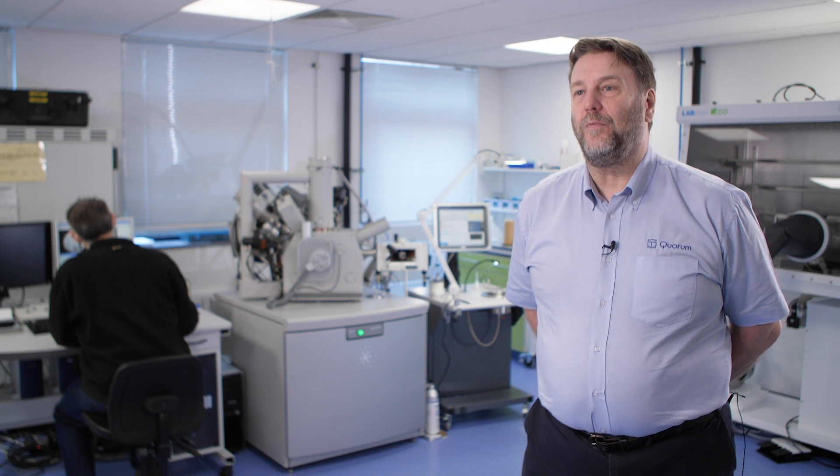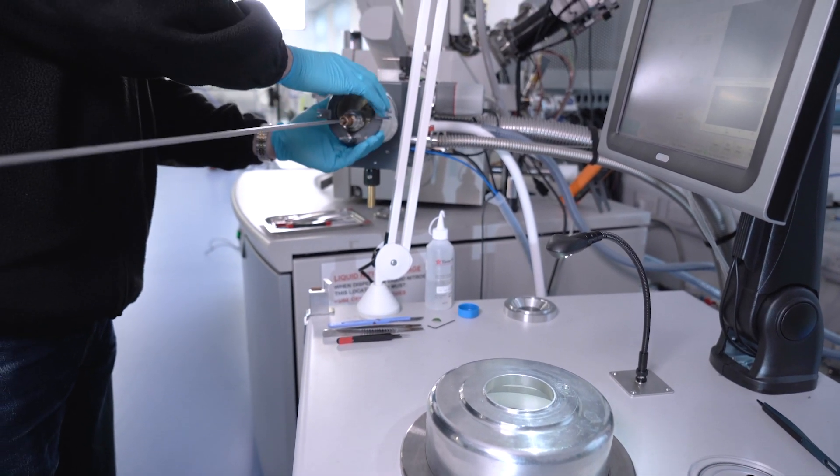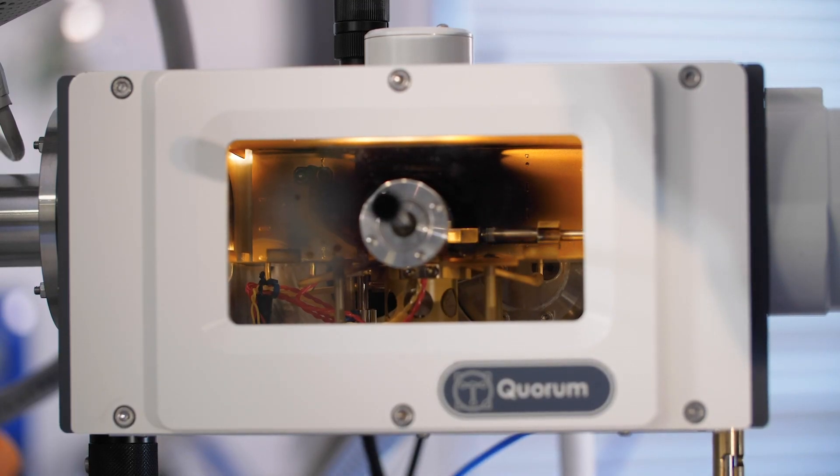Because the system is controlled by a touchscreen PC, the automated startup process guides the user through every single step — pumping down the system and running cooling to the set temperatures. When the system-ready sign comes up, the user is ready to make their first sample. Sublimation, sputter coating, and carbon coating are controlled by recipes and are fully automated, making it very quick and easy to use the same process repeatedly or to recall those processes and replicate the exact same preparation at a later time.